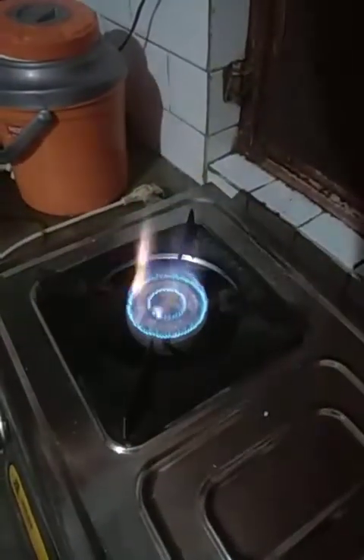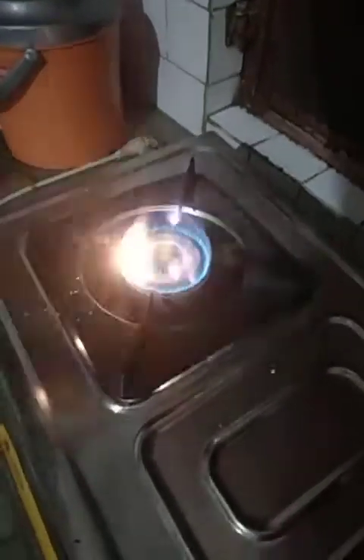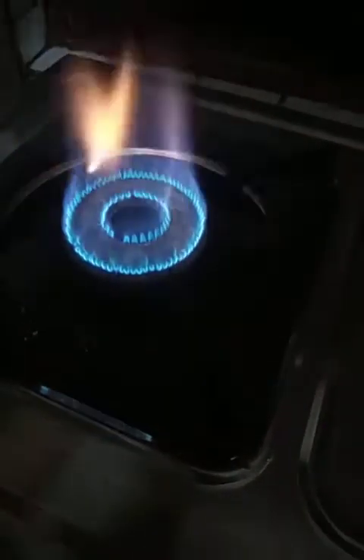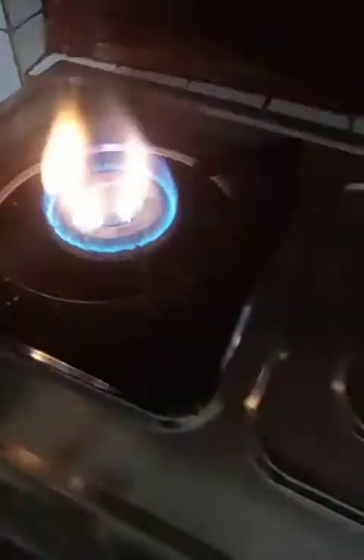Now let us try another compound, that is your potassium iodide. Let us see what color the potassium iodide gives. You can see a violet color is being produced.